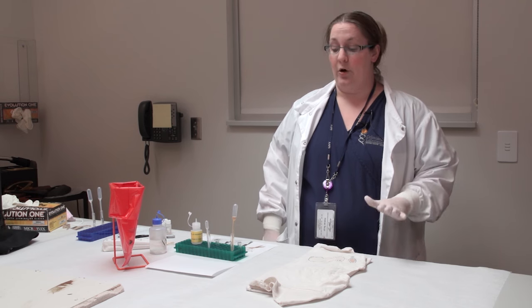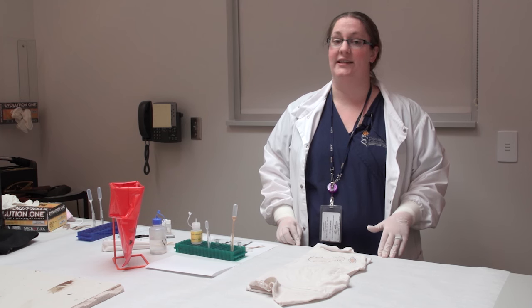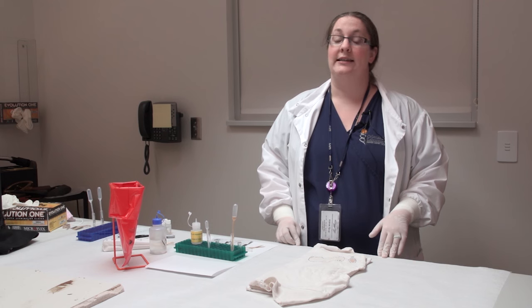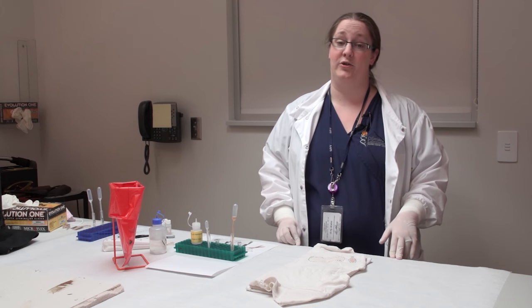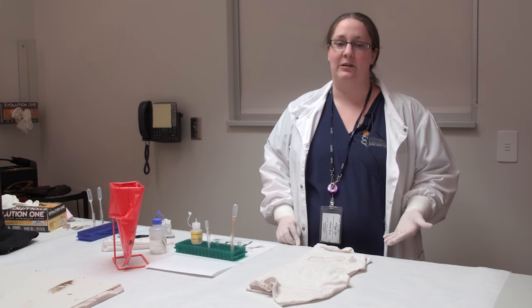The next set of tests are the three tests we have to identify semen. Being in the DNA section, we get a lot of sexual assaults and semen is the main body fluid we're looking for. The first test is called the acid phosphatase test - it is a presumptive test, very quick, and it's actually testing for an enzyme found in seminal fluid. It's found in other body fluids as well, which is why it's presumptive, but it's found about 20 to 300 times more concentrated in seminal fluid than any other body fluid, so it's a pretty good indicator.